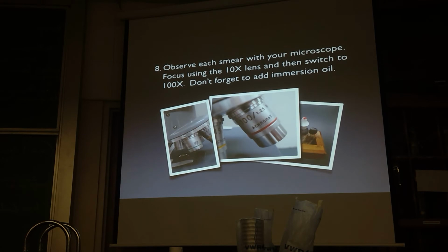And just focus with 10x and then look at them with 100. Don't use the 45. You're going to get refraction with the 45x and you can't do anything about it. So focus with 10, then go directly to oil.